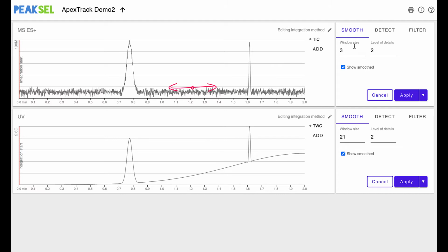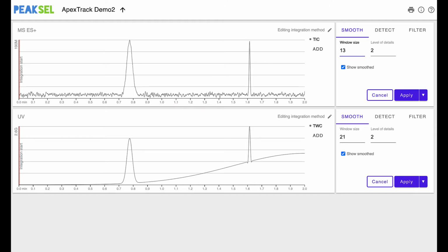Many smoothing algorithms go over each point in the signal, take some number of its neighbors from both sides, and move the central point either up or down relative to the neighbors. This chunk of a signal is called a window, and the wider the window, the more smoothing is applied. Let's see how window size changes the resulting signal.